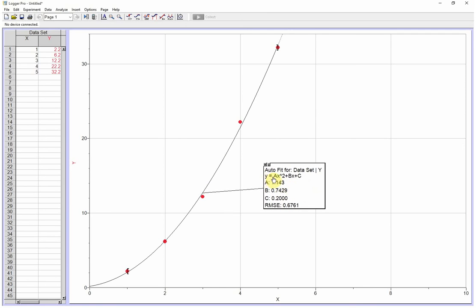Again, it gives you the format, y equals Ax squared plus Bx plus C, and our values of A, B, and C. Very similar to how Desmos handled it.